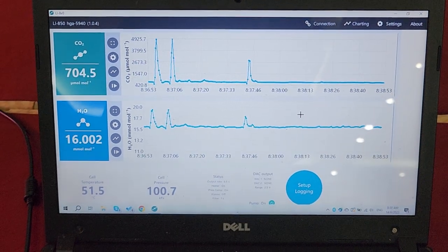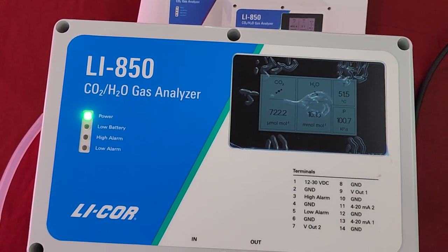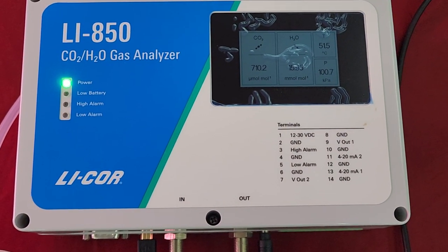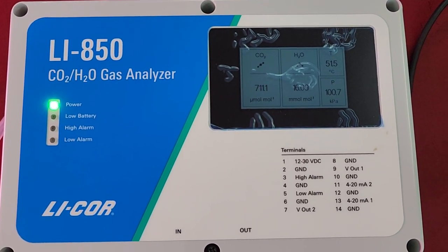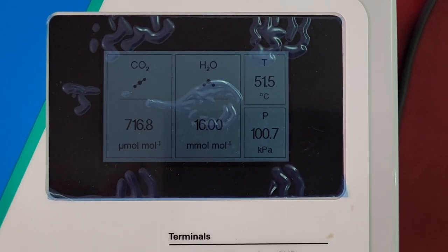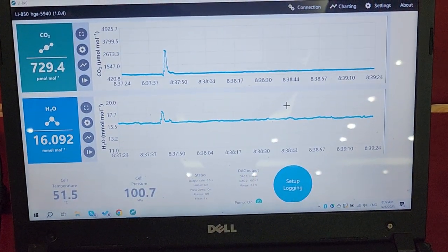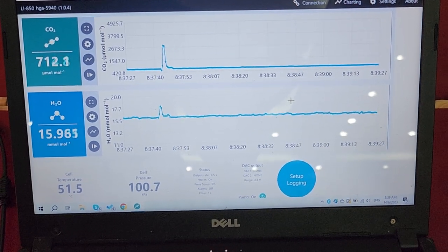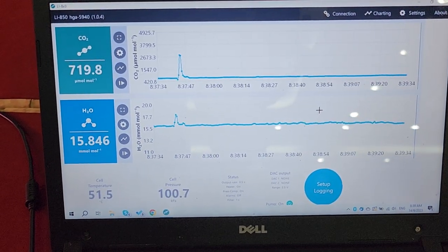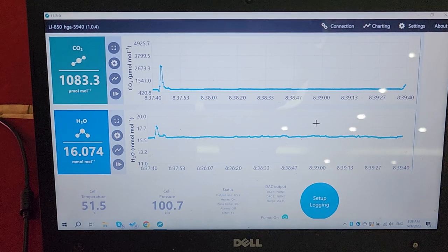Why is water vapor surrounding the plant important? Have you learned or not? Why is it important? Okay. If the humidity is high, the transpiration rate will be lower. If the transpiration rate is high, the? If the humidity is high, the transpiration rate will be lower. Why? Almost there, getting there. You see, you can move around now.